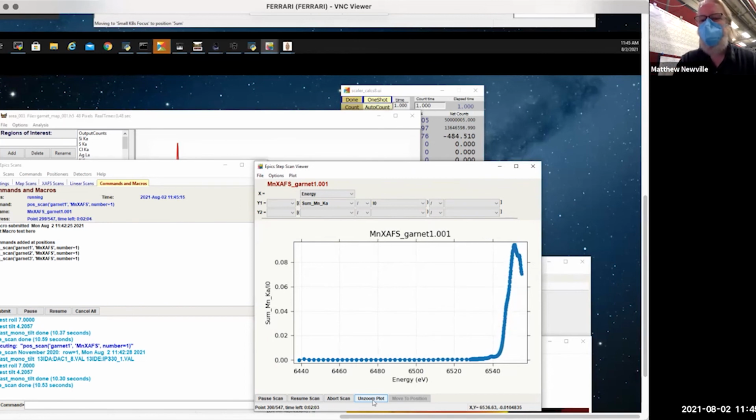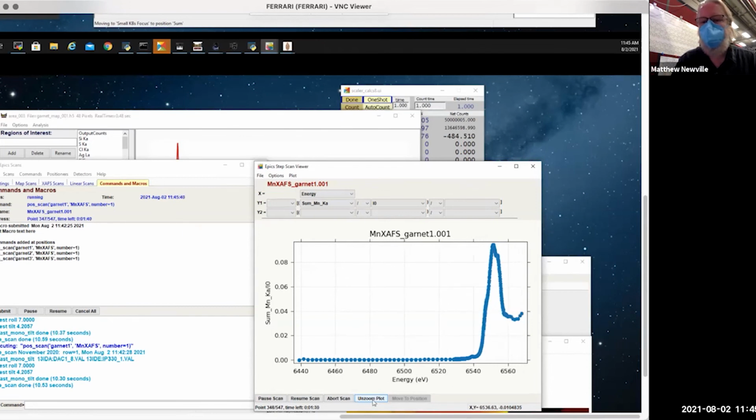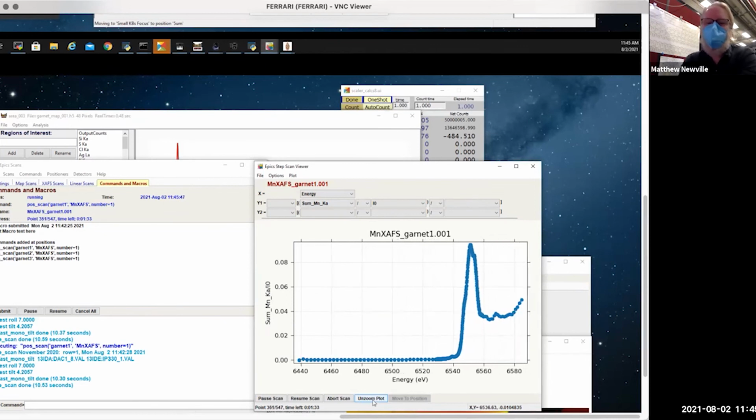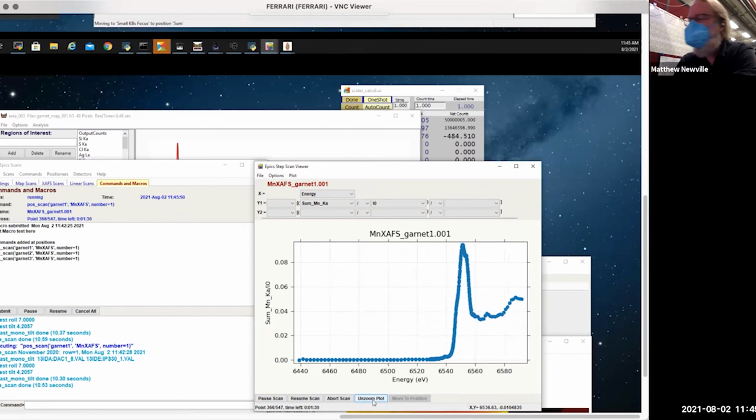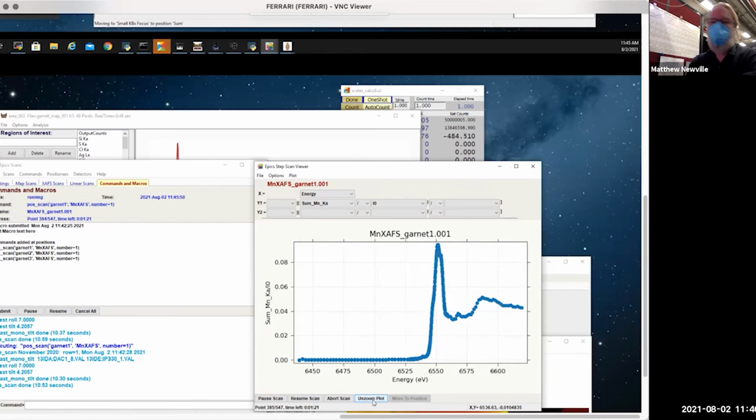There's a question from Adriana. What garnet is that? Yeah, I should know that, and I can't remember. Tony is out today. Tony Lanzarotti, my B9 scientist collaborator, knows these. It's a yttrium-bearing garnet, and mostly it's interesting for its rare earth composition. I don't need the details of this one, but it shows this amazing banding, at least in the yttrium that we're not looking at here.